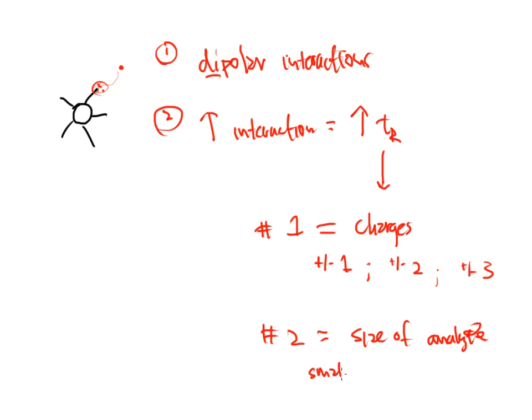Typically, small ones come off first, and then we get our medium-sized ones that come off second, and then we get our big-time large ones coming off third. So two things are really in the picture, and they're playing off of the same thing at the same time. Order of elution or retention time is based on charges, and it's based on sizes. All right, so let me give you an example.